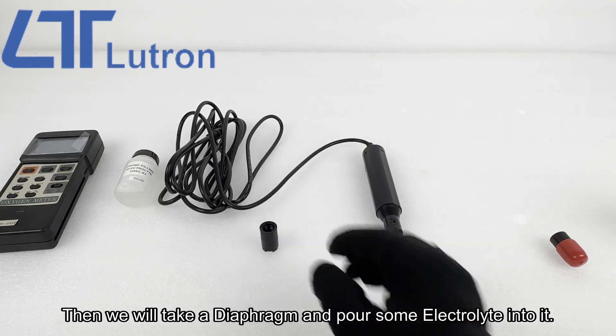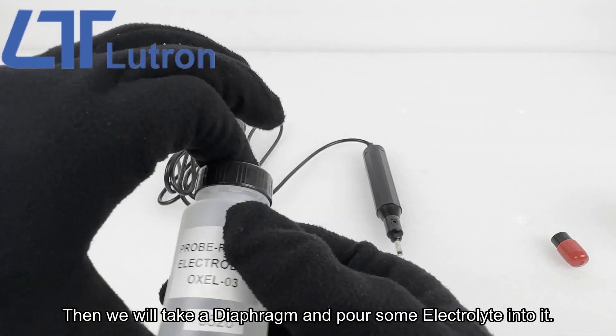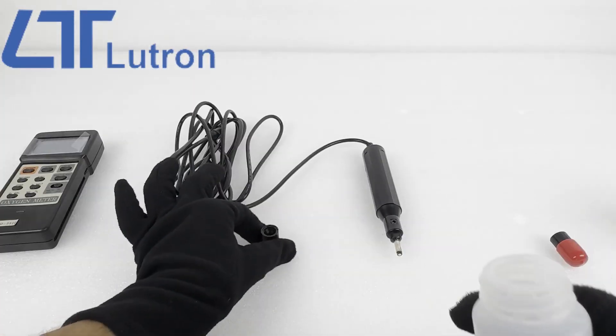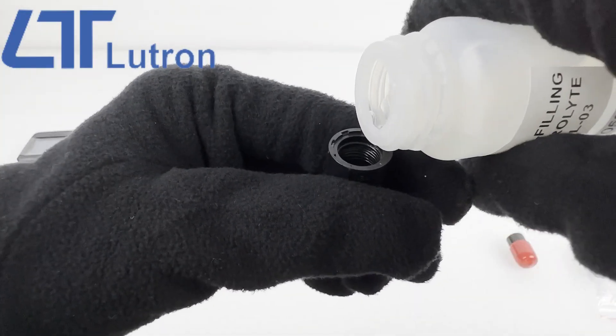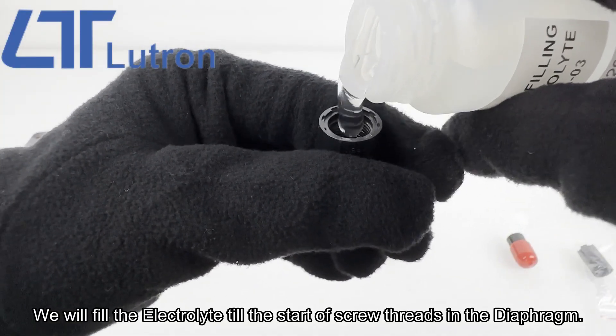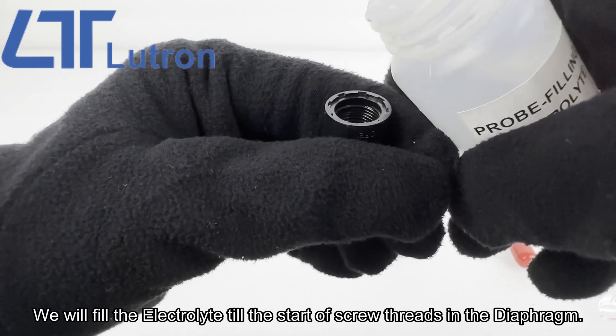Then we will take a diaphragm and pour some electrolyte into it. We will fill the electrolyte till the start of screw threads in the diaphragm.